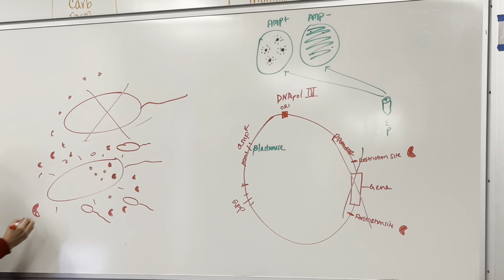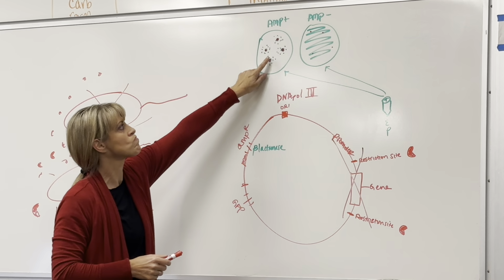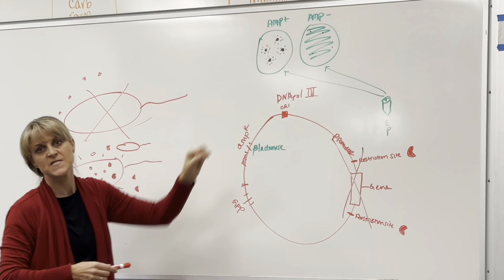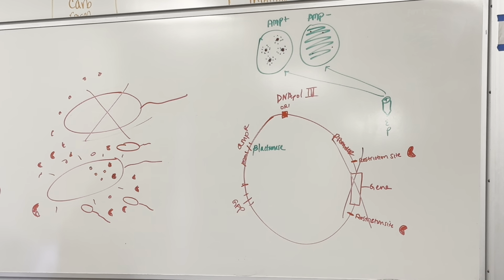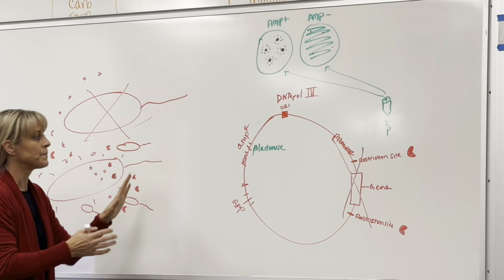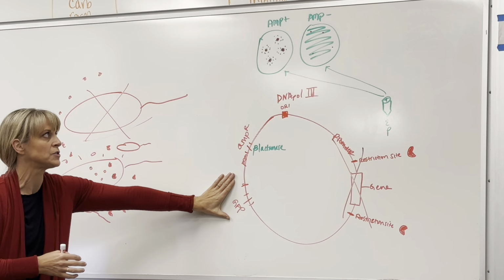Does that make sense? Does the satellite part of it make sense? Yes? No? Thumbs up, thumbs down, medium? Okay. You said the satellite colonies don't necessarily have the uptake of the plasmid? Yeah, they don't. These ones don't glow in the dark. They're just lucky because they have a good neighbor. Yeah, they have a good neighbor. So they're like hiding under the umbrella of the ones that are protecting them. Yeah. So, okay, that's ampicillin resistance, that's GFP.